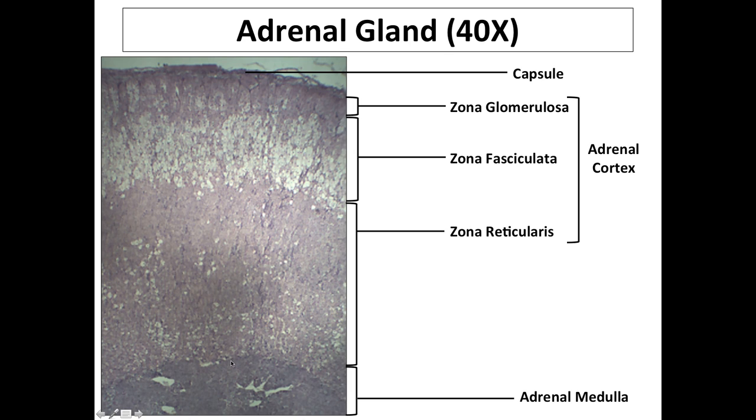The adrenal medulla is going to be secreting neurohormones like norepinephrine and epinephrine, but the cells that are here are more representative of the nervous system than they are of a gland, like you would see through the rest of the adrenal cortex. The cells that are here are a lot like neurons that just don't have dendrites or axons. We have often referred to the adrenal medulla as a postganglionic sympathetic neuron cluster, and that's really what it is. You're going to have a preganglionic sympathetic neuron that targets that region, and it is going to be the cause of hormone or neurohormone release into the bloodstream.